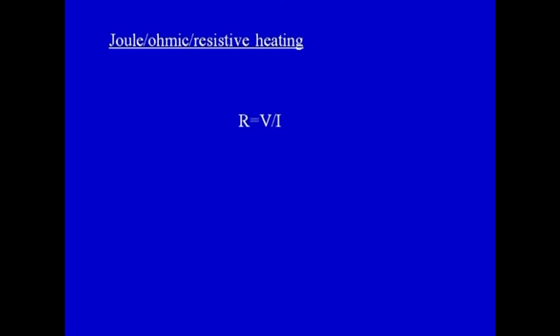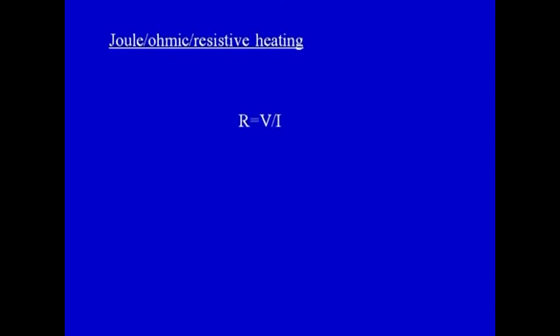So, one factor was the electrophoretic mobility. Now, another factor which is important in the migration of the charged species or electrophoresis run is the heating, which is called Joule heating or ohmic heating or resistive heating. When the current in the solution between the electrodes is conducted mainly by the buffer ions, a small proportion being conducted by sample ions, then Ohm's law expresses the relationship between the current, voltage and resistance, which is given by this particular equation.